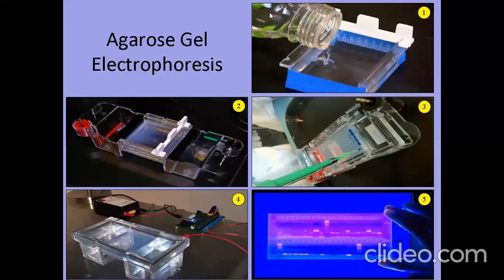We can also add ethidium bromide in there and mix that, and then pour it into the casting tray, and it will solidify with time as the temperature reduces and reaches 40. After solidification you can see this gel. It's like this. Is it clear? This is now milky, and before it was transparent.